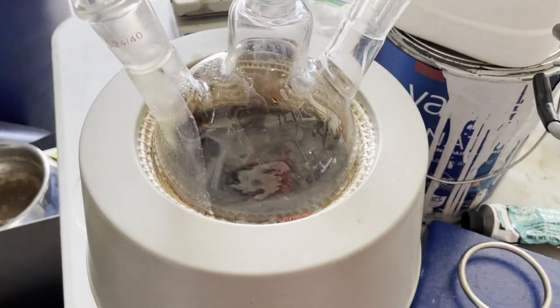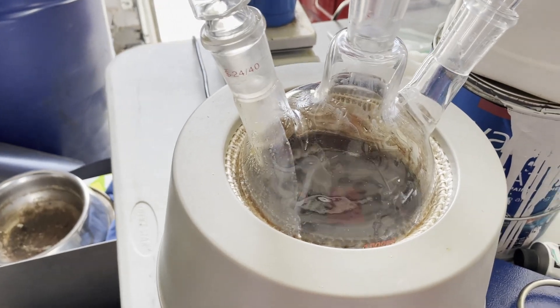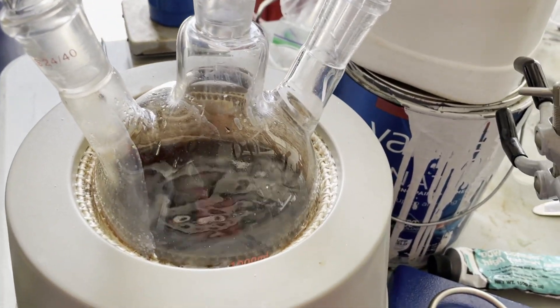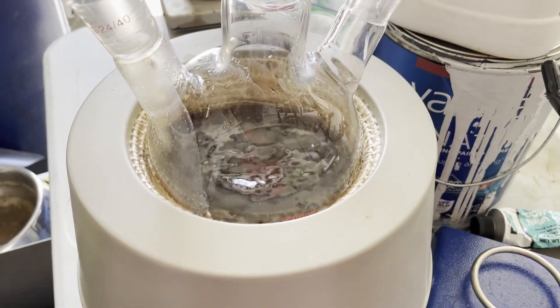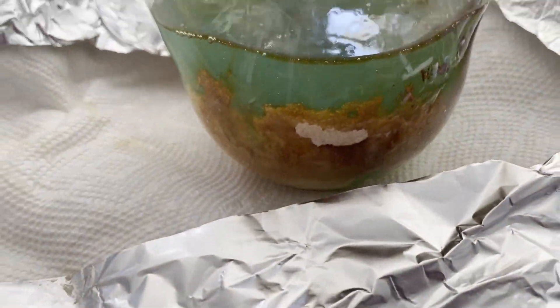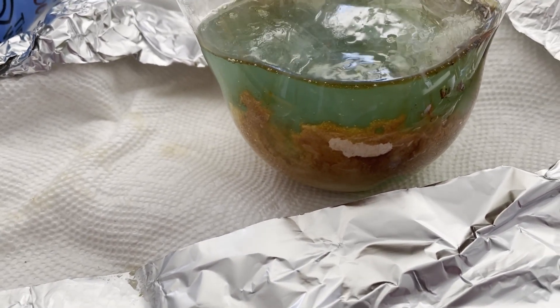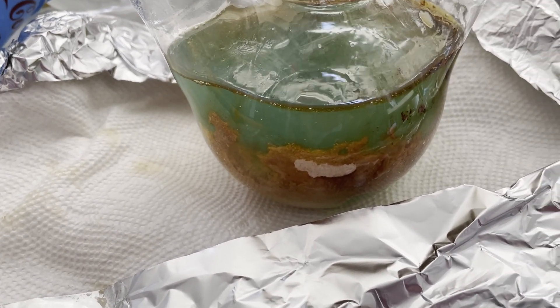It's supposed to be clear. The paper said that the quality of the sodium ethoxide greatly affects the yield, so I hope this doesn't affect it too much. Even with all this ethyl acetate, I still couldn't get all the sodium ethoxide out. There's a bunch left in the flask, so I just destroyed it using water, and the water turns green — not too sure why that is.